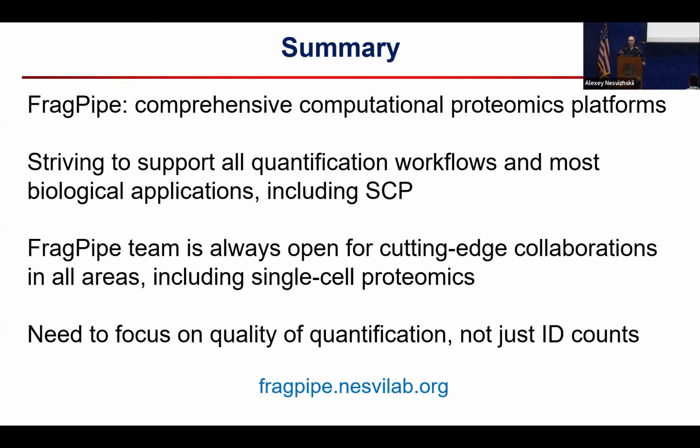Our default option now is the MSFragger-DIA method, where we first search each MS2 scan for all candidates without assembling precursor-fragment groups, without what DIA-Umpire is doing. We flip the order of events. We first detect all candidates for each spectrum, as if it was a regular database search. Then we take those candidates, create spectra with the fragment ions, and trace them in the data in a peptide-centric way. So that's our preferred strategy now, and DIA-Umpire only for certain applications like immunopeptidomics.